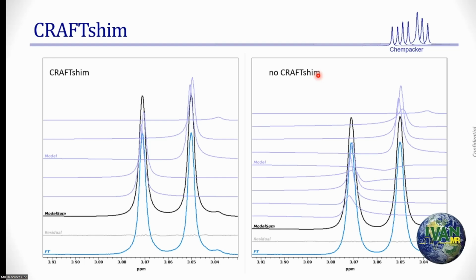We talked about this in one of the earlier lectures. You can actually resolve what are not resolved in the conventional FT fashion. You can resolve in time domain analysis fashion. I am using Bayesian. It doesn't have to be Bayesian. Some good mathematician can come in and give me something better. That's okay with me. Because we are now relying upon the uncertainty in fitting that sub FID into a number of exponential decay models.